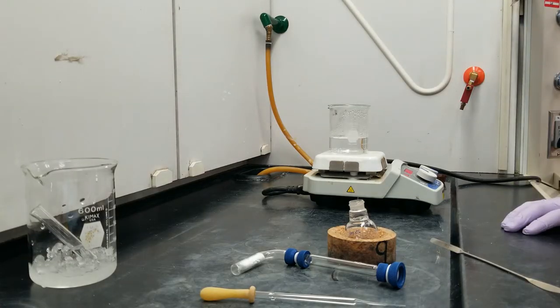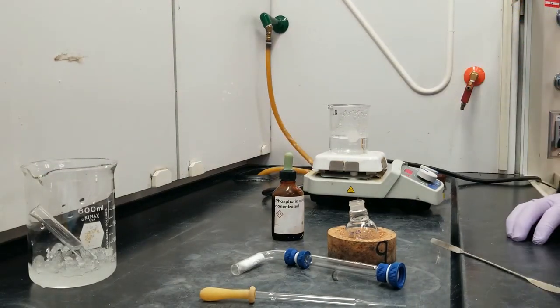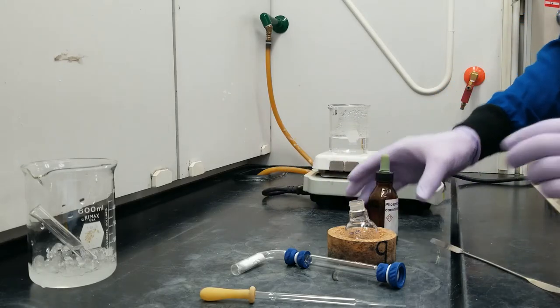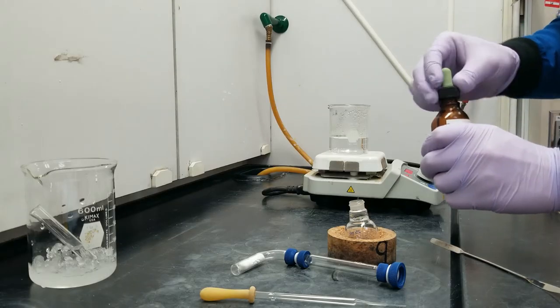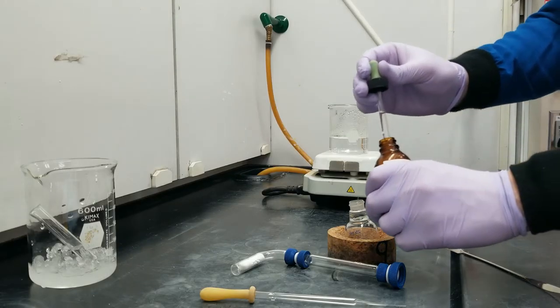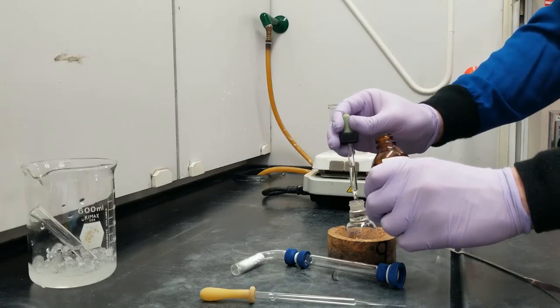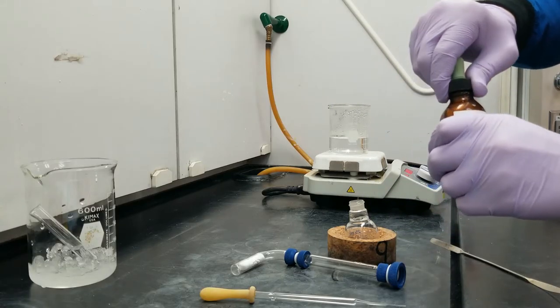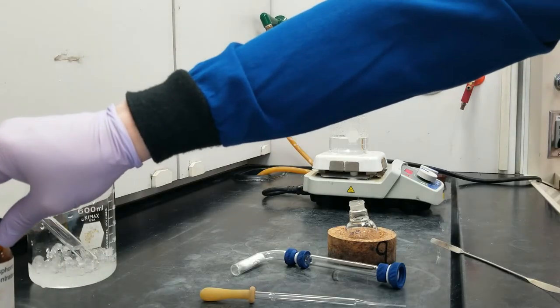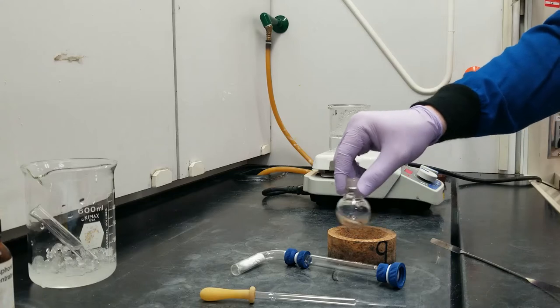So, now that that's in, we're going to add our catalyst, which is a strong acid, and today's choice is phosphoric acid. And I just need 2 drops of this. It's very concentrated, and it's also just a catalyst, so the exact amount of this doesn't matter as much. Two drops. Alright, let's swirl those together and just let them mix before I introduce the ferrocene.